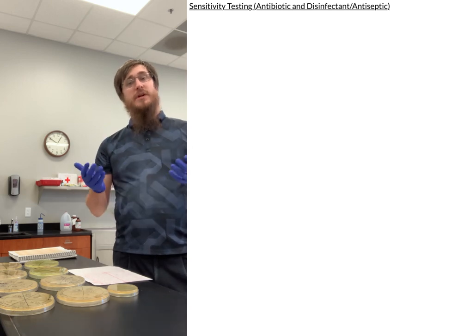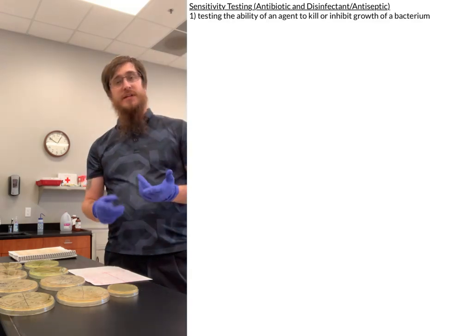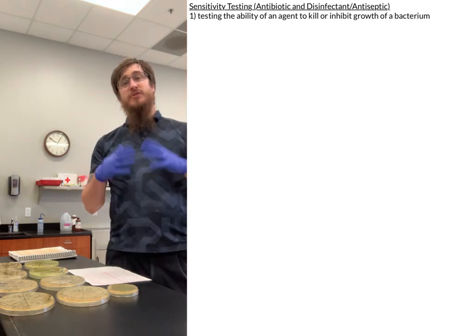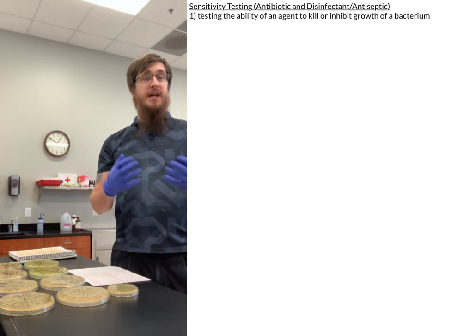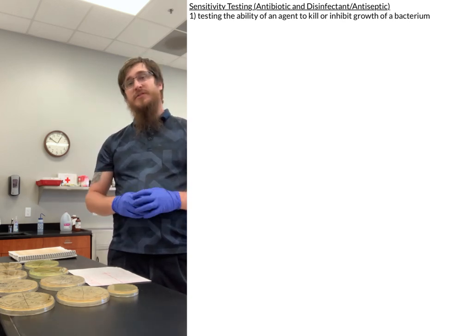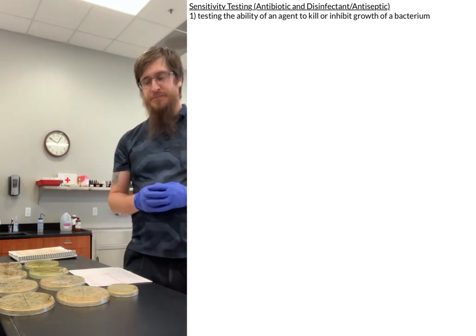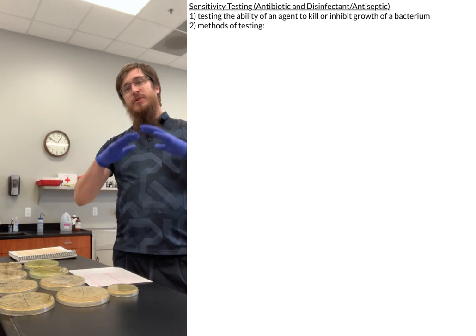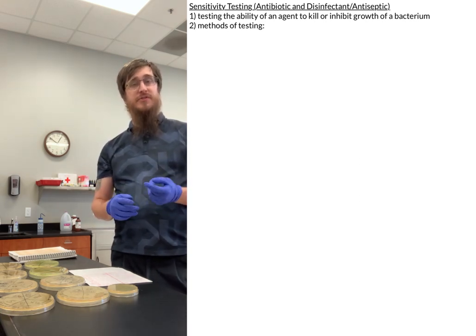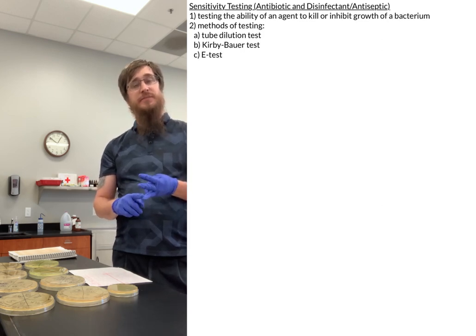But really, when we're talking about sensitivity testing, what we're saying here is that we have an agent, again, whether that's an antibiotic, disinfectant, or antiseptic, and we want to know how well does my agent basically kill a specific type of microbe. So that's kind of the basis of this sensitivity testing. And there are three basic ways that we can go about doing sensitivity testing. There's a tube dilution test, a Kirby-Bauer test, and an e-test.